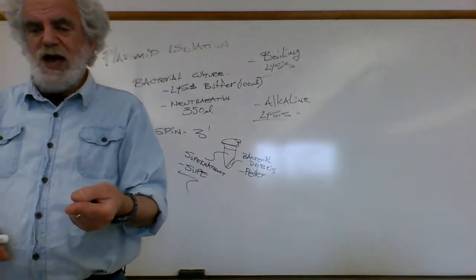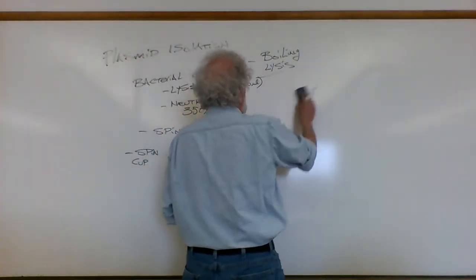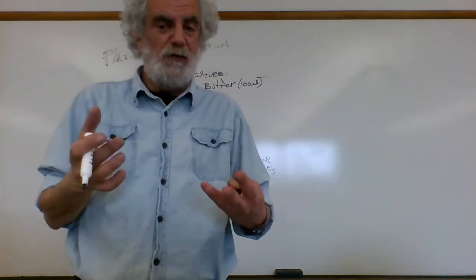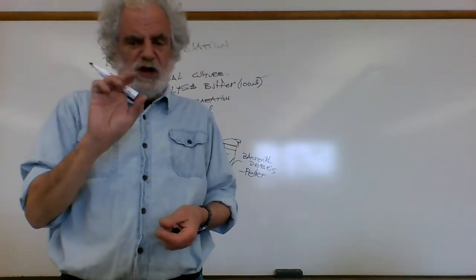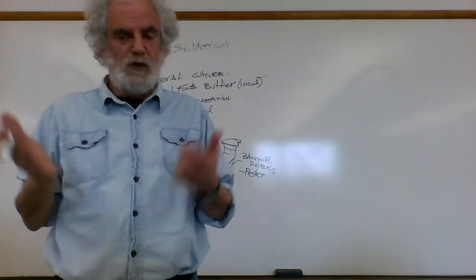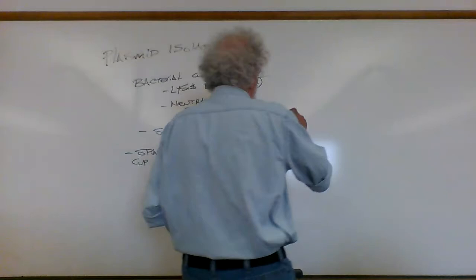There's a wash step. We're going to add 200 microliters of an endotoxin removal solution, which used to be an optional solution, but they now include it. Endotoxin is stuff that, if you were trying to put this into some kind of animal culture cell, could mess the cells up, and it's generally small sugar molecules and some lipids, and it's part of what makes bacteria really toxic. We're working with non-toxic bacteria, so you don't have to worry about it. Regardless, we do the endotoxin wash, which is 200 microliters, again for a 15-second spin.